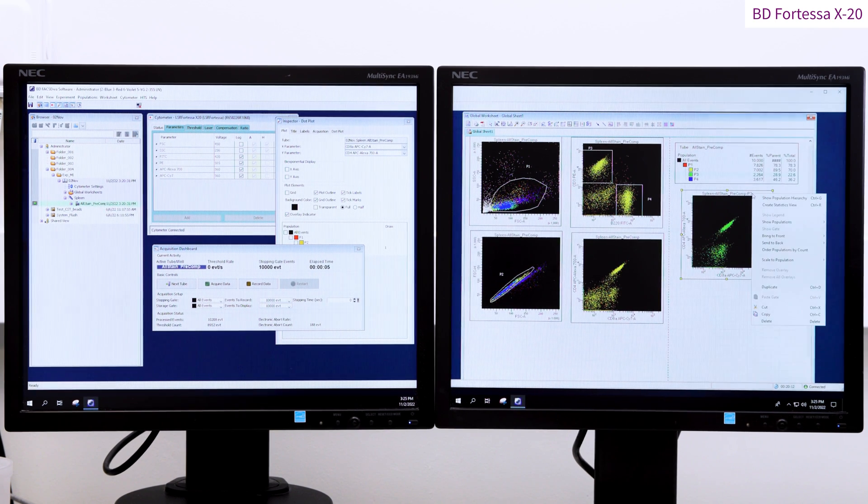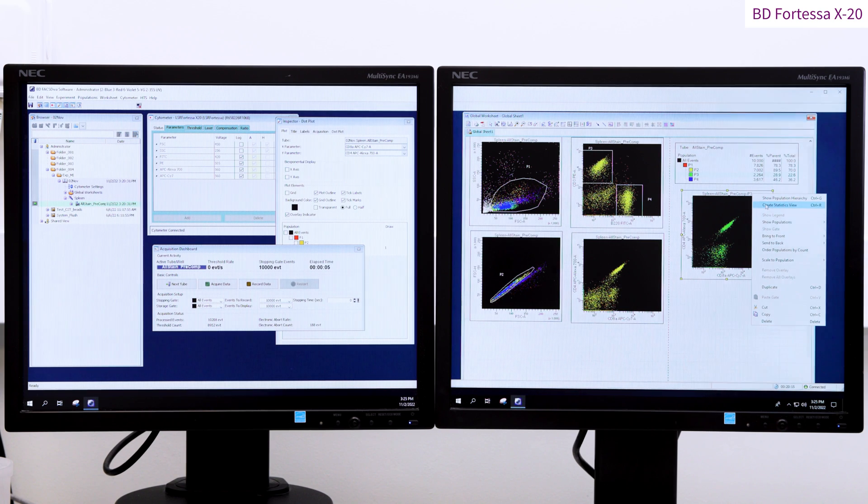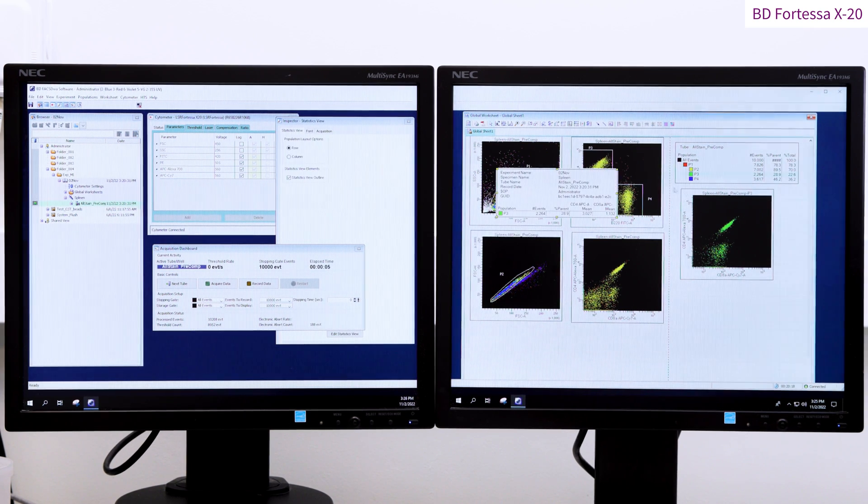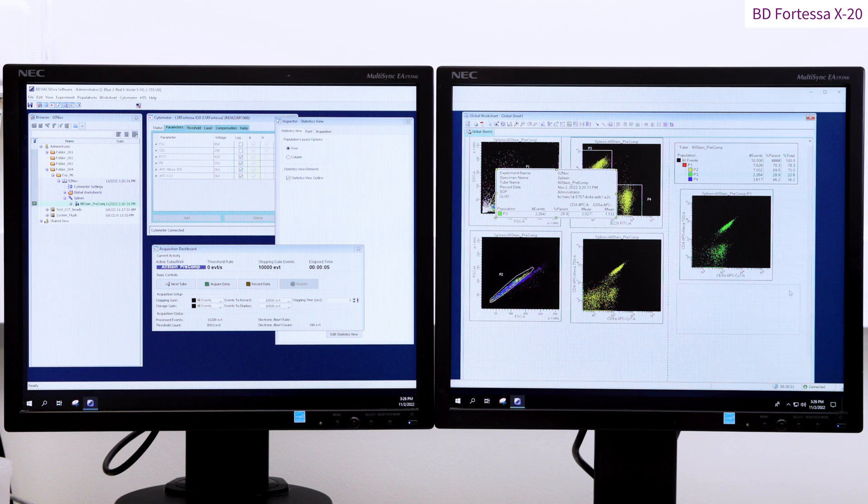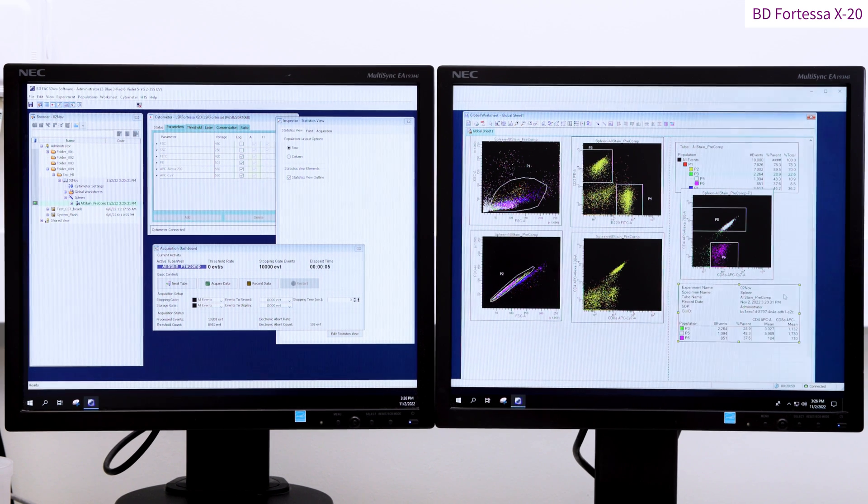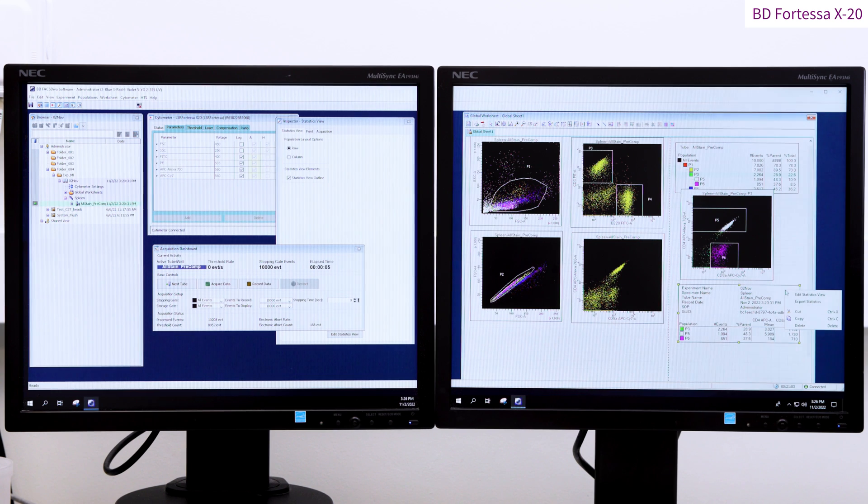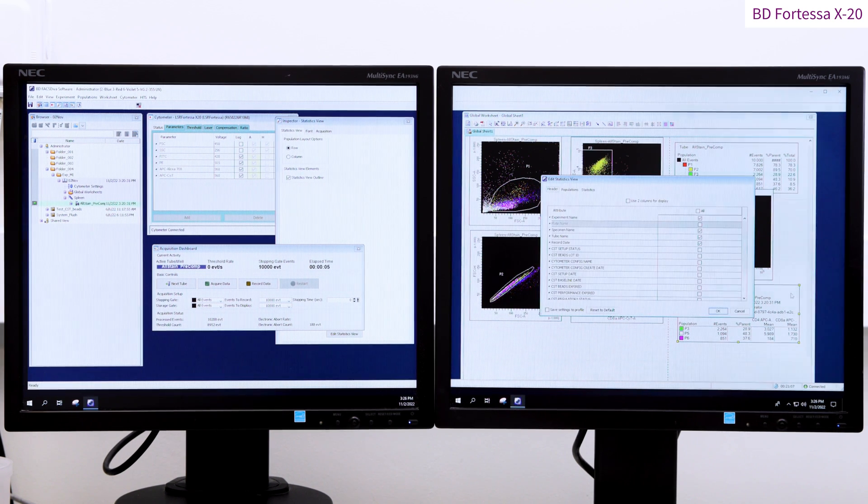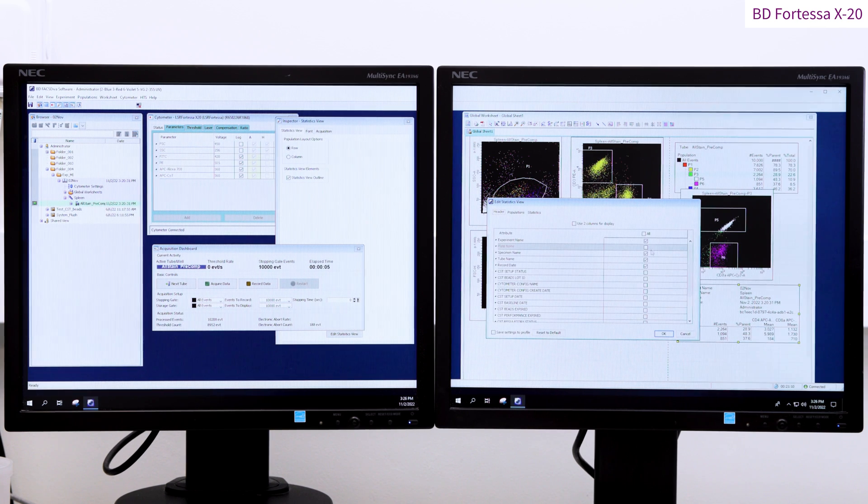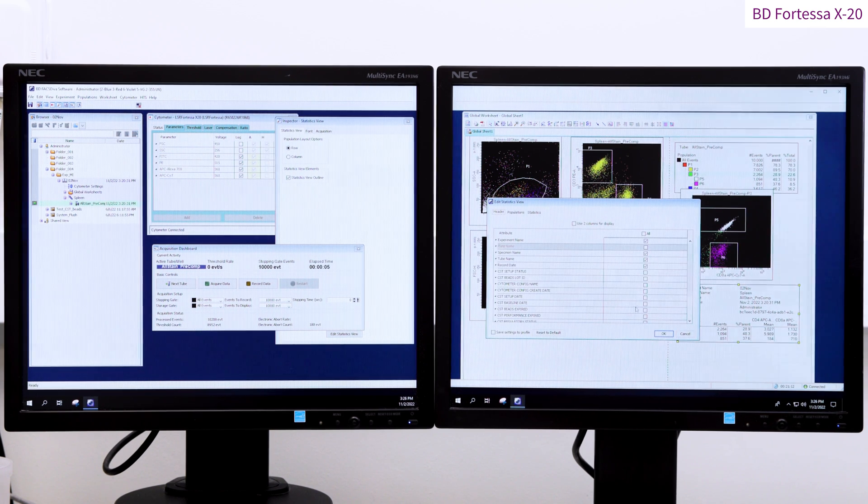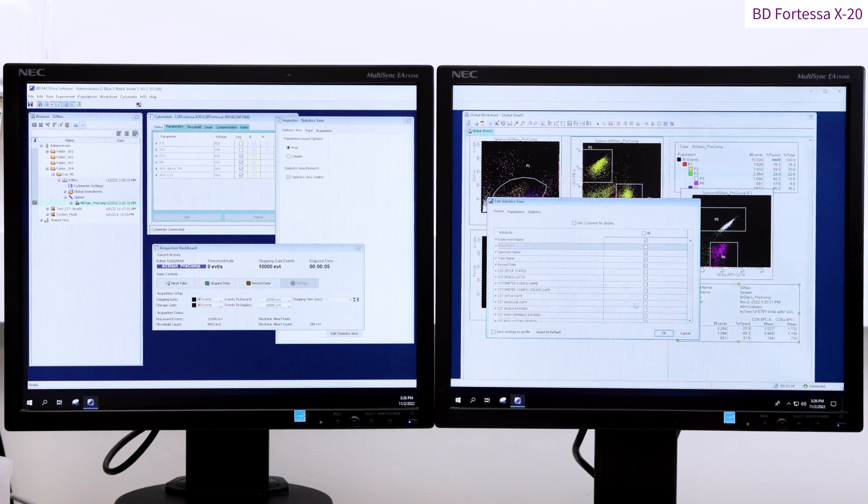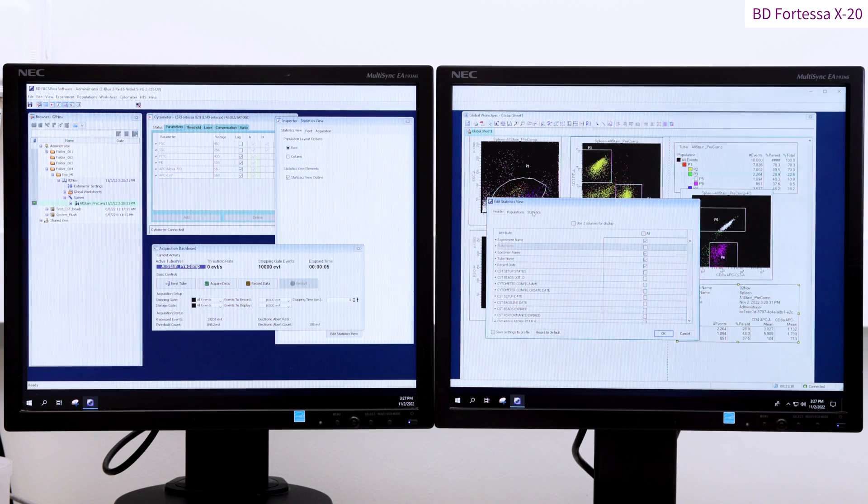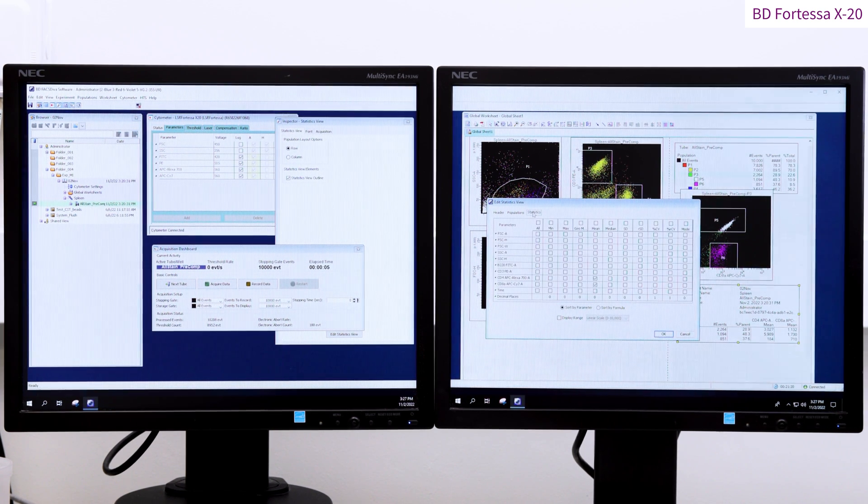Right clicking on the dot plot allows you to create a statistic view table. The statistic view table is useful to monitor the median fluorescent intensities and the quality of your compensation matrix. To access the median fluorescent intensity values, right click on the statistics view table, click on the statistics tab and deselect mean and select the median.